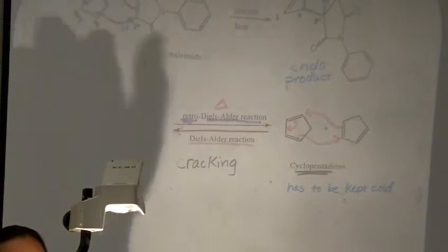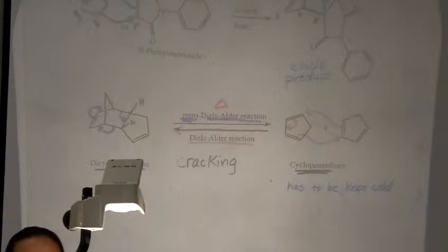All right. So you will dispense the ethyl acetate solvent. You will dispense the N-phenylmaleimide. Get this dissolved in the ethyl acetate. So you should have a solution, no solid hanging around. Then come see your lab prof. They'll give you your cyclopentadiene for your reaction. All right. And it really quickly will react. As soon as it goes in, it will start reacting. Even without stirring, even without refluxing, it'll react pretty quickly. Right? Okay, questions at all about the reaction?